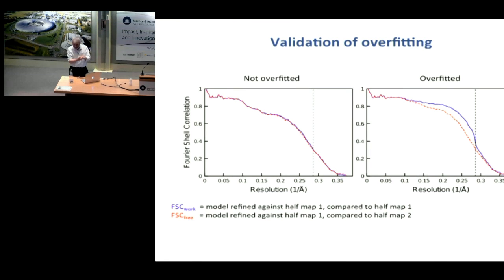Unfortunately, for CCP4 you need reflection data. But for CCP-EM, is it there? You can get the reflection data from the map data. But what I mean is, there's NCS, but can you add a keyword? Yes. You can use CCP-EM, and you give everything, and then I'll send you one line, and one line is sufficient to use NCS. Okay. One day after tomorrow, please.